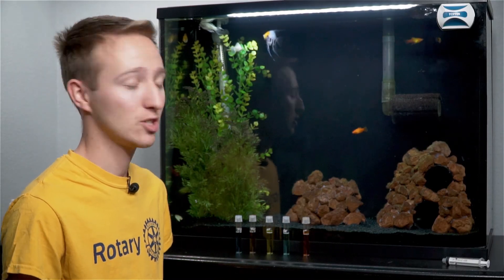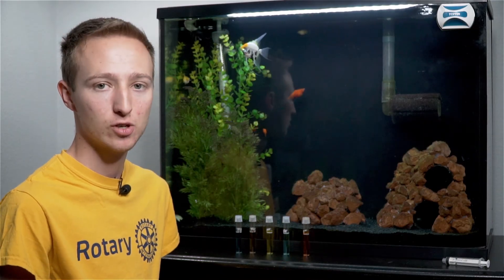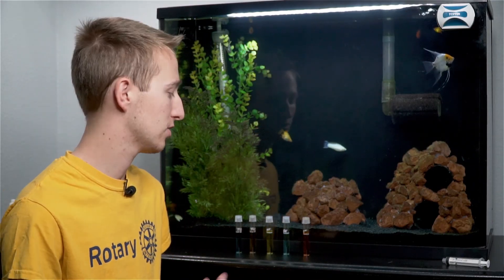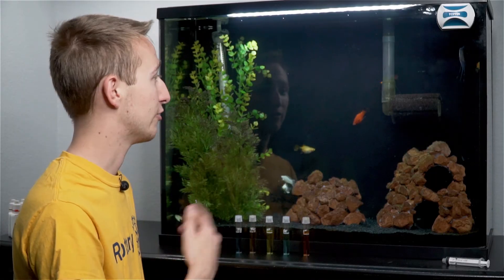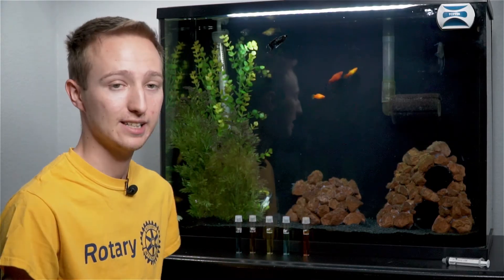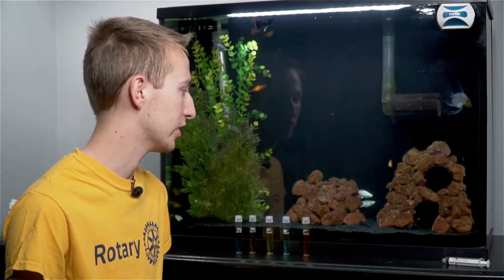That's it on how to test your water with the API Master Test Kit. API makes a whole bunch of other testing kits too — they do like the GH and KH. I've got that for my shrimp tank. Once you get your tank cycled, I personally test my tanks once a month. I don't test every single water change. If the fish are doing something weird — like sitting at the top when it's not feeding time — obviously something's wrong and I'll test it to see if there are any ammonia spikes I might have missed.